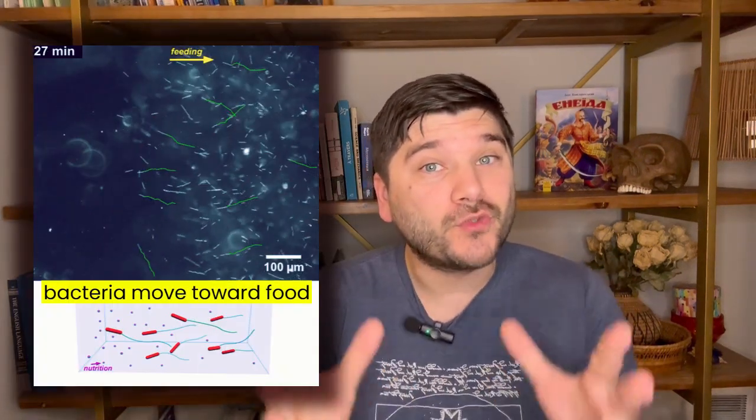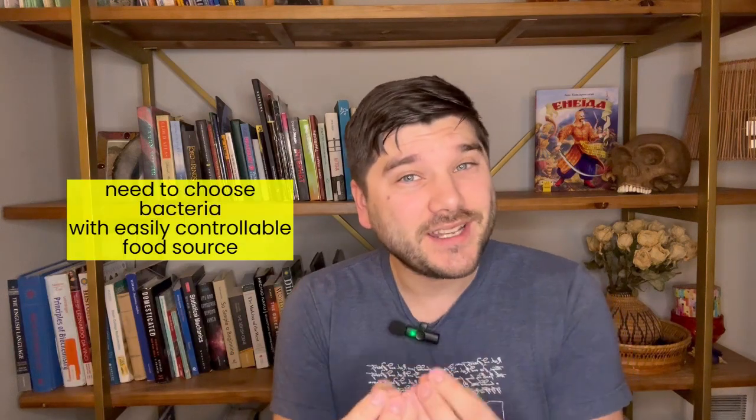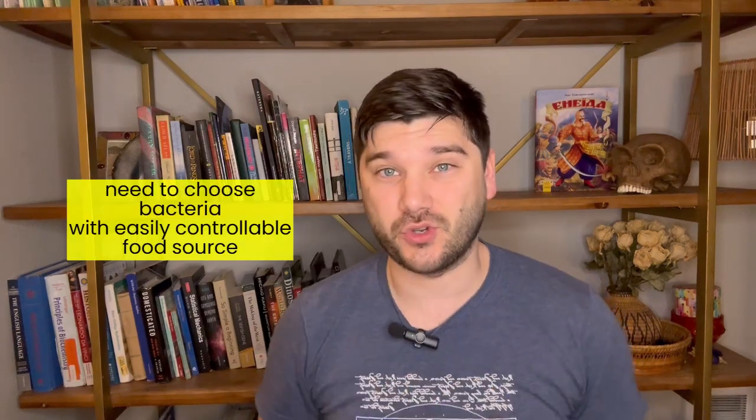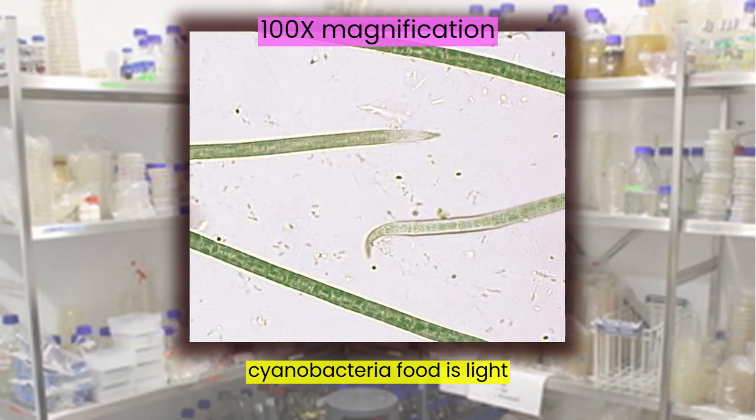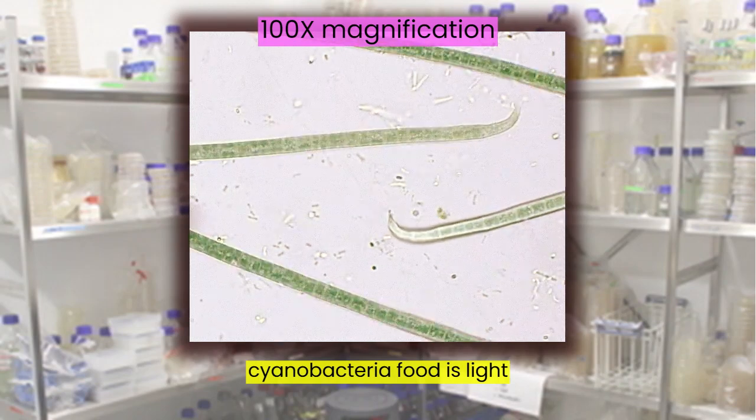Check this out. Bacteria prefer to move towards their food source. This phenomenon is called chemotaxis. So let's choose the type of bacteria for which it is very easy to control their food source. For example, cyanobacteria. In the case of cyanobacteria, the food source is light.